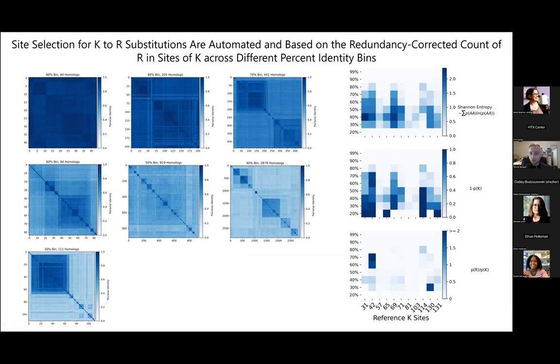What I do traditionally when using this program is I'll take a protein target whose structure is unknown. I'll feed it to the NCBI BLAST and I'll get 5,000 homologs. Then I will use a server like MAFFT and align all of the homologs to each other and to the reference, and then input that alignment file into the BULKARCH program.